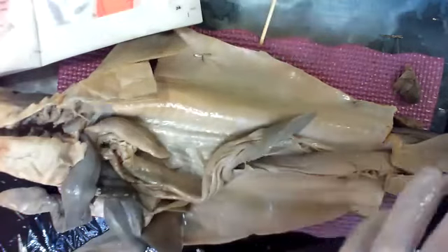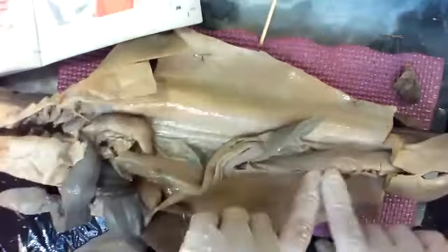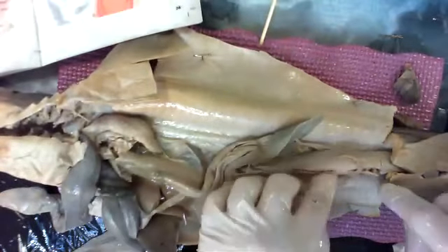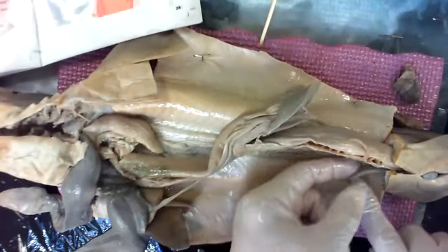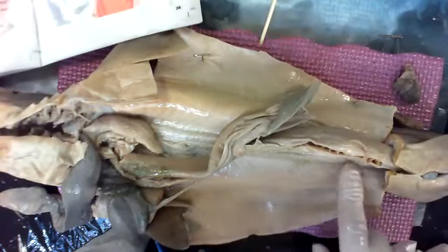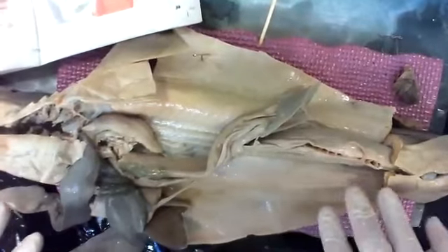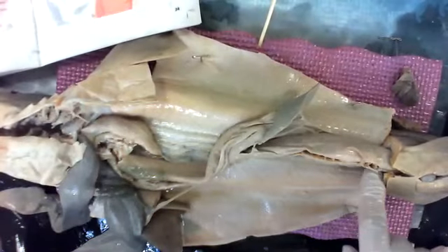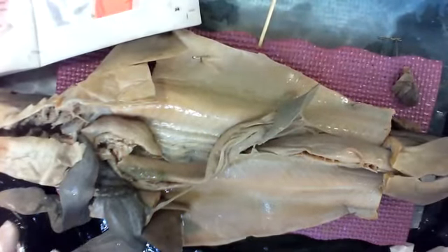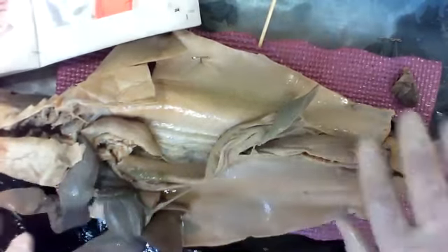There's no anus. The cloaca is all of the outputs on the bottom part of the body. That's the GI tract. There's one thing that's left here, this little thing hiding, called the rectal gland. This is kind of like a kidney. It filters salt because a shark swims in salt water, and salt water is actually pretty bad for you. So as it eats a lot of salt, this catches the salt in the blood and then pushes that extra salt out the cloaca and recycles it back into the water. Right? That's what you're looking at.